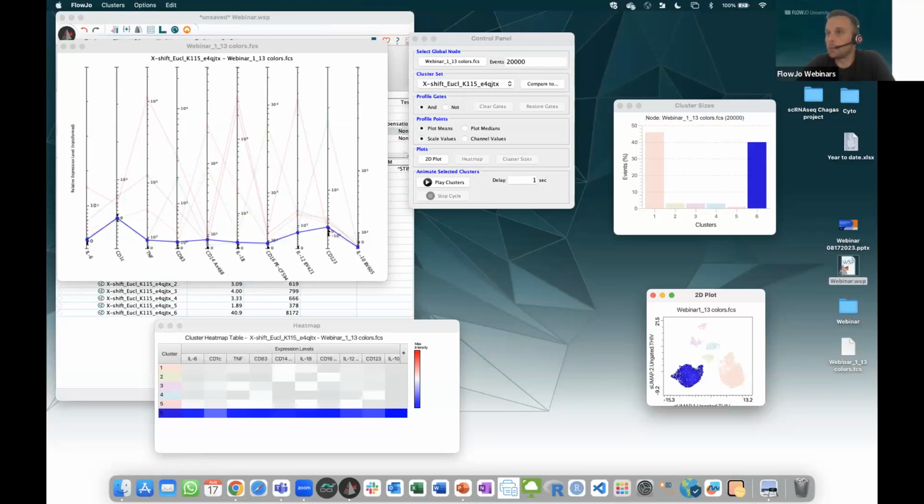Another question before cluster analysis: do we need to downsample our lineage population to an equal number for normalization? So downsampling is mostly to make sure that one condition doesn't overload the algorithm compared to another one.